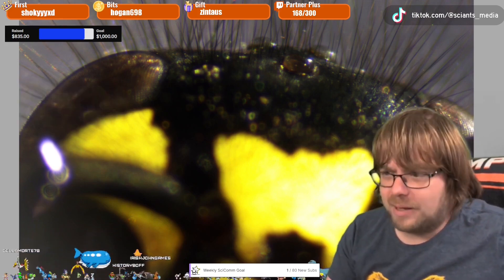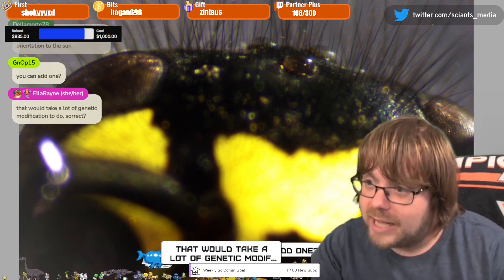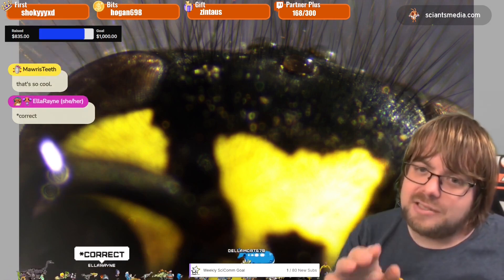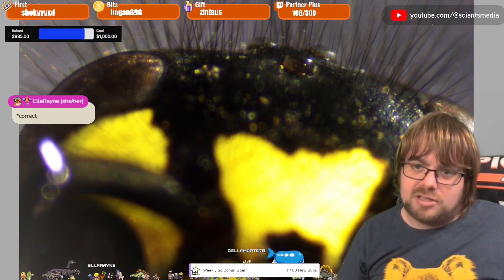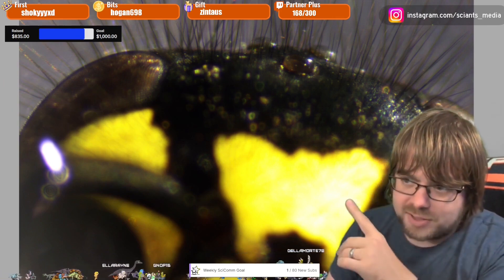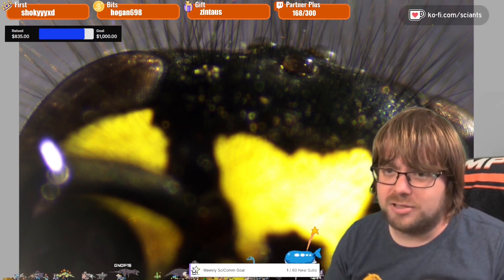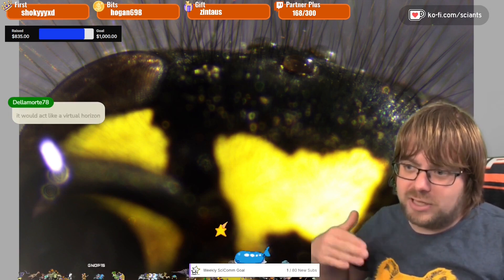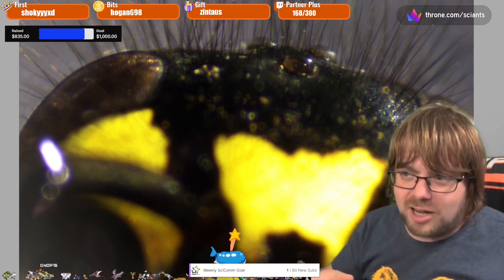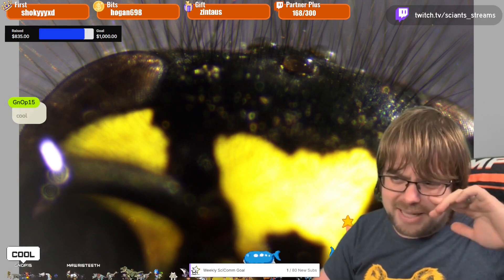Their antennae are their noses. In a second I'll pop open this one's head and we'll be able to see in the brain where the processing center for smell is. As for adding ocelli via gene editing - it's not as simple as one gene. It's easier to break something than to fix it. If you identify the genetic elements that make these false eyes and knock out that gene, you'll probably break the false eye and can ask what it does that way. Adding it usually requires multiple genes, and since it's a structure you have to time it correctly during development, making it much harder.